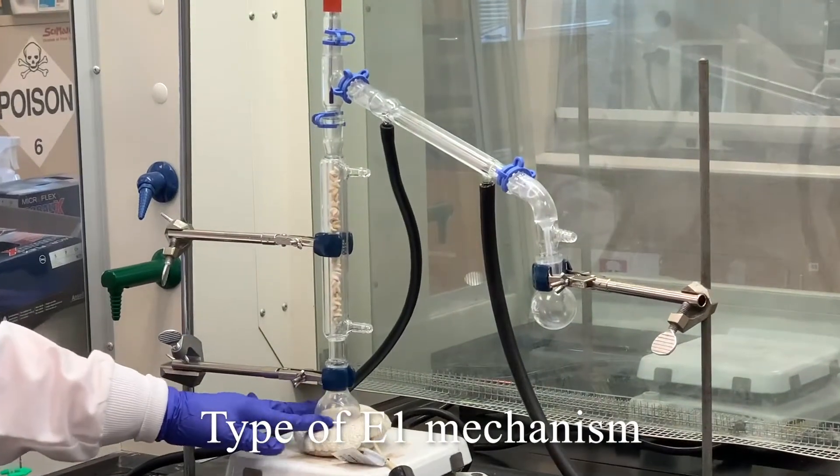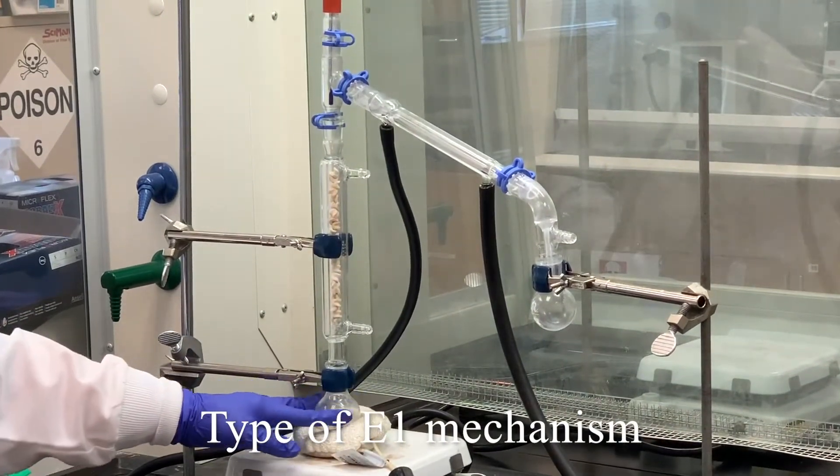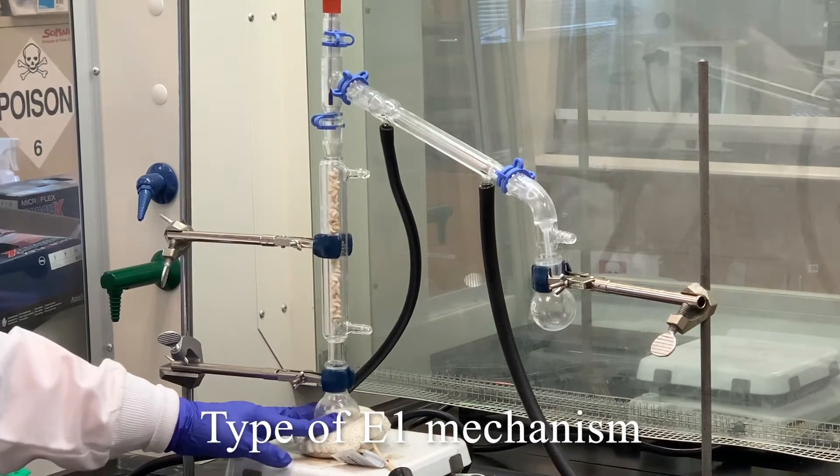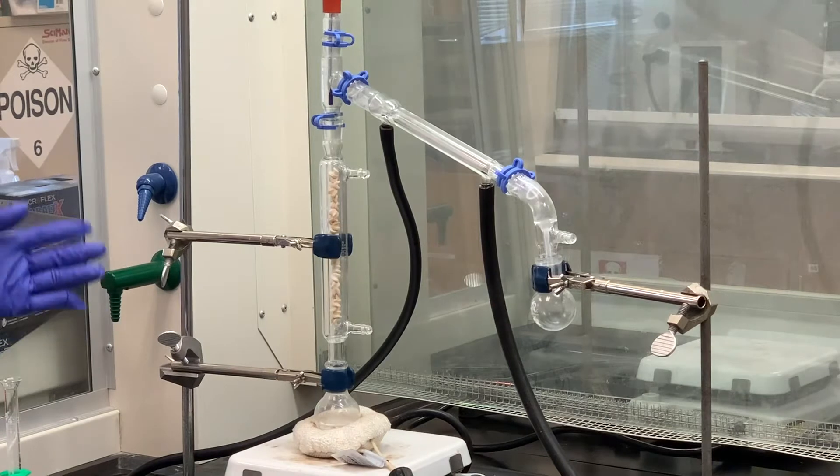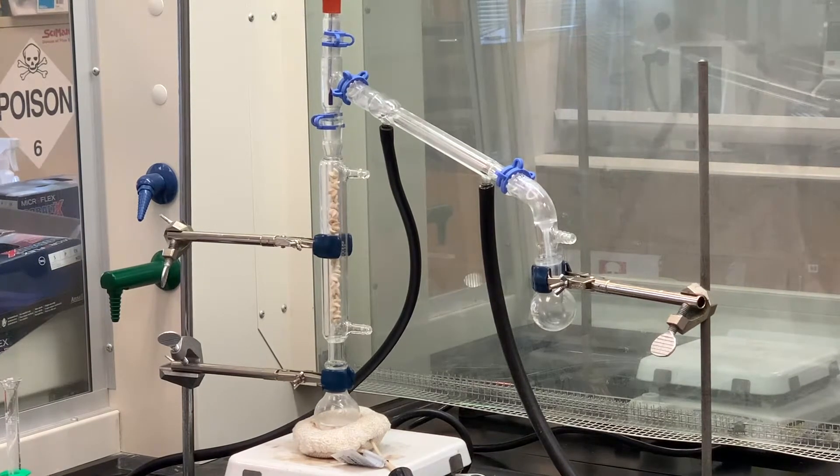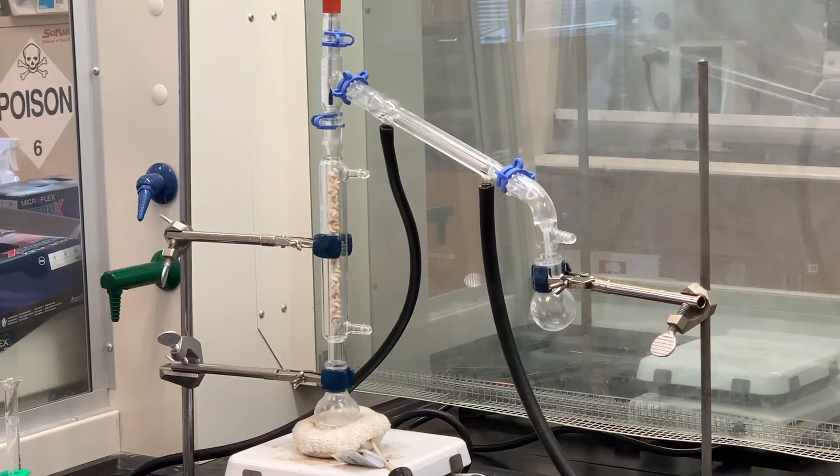So we're going to turn the heating mantle on in just a second, but I have a mixture of the cyclohexanol and the nine molar sulfuric acid. And what happens during that mechanism is that the OH group of the cyclohexanol is protonated. That becomes a good leaving group. It will leave and form a carbocation.